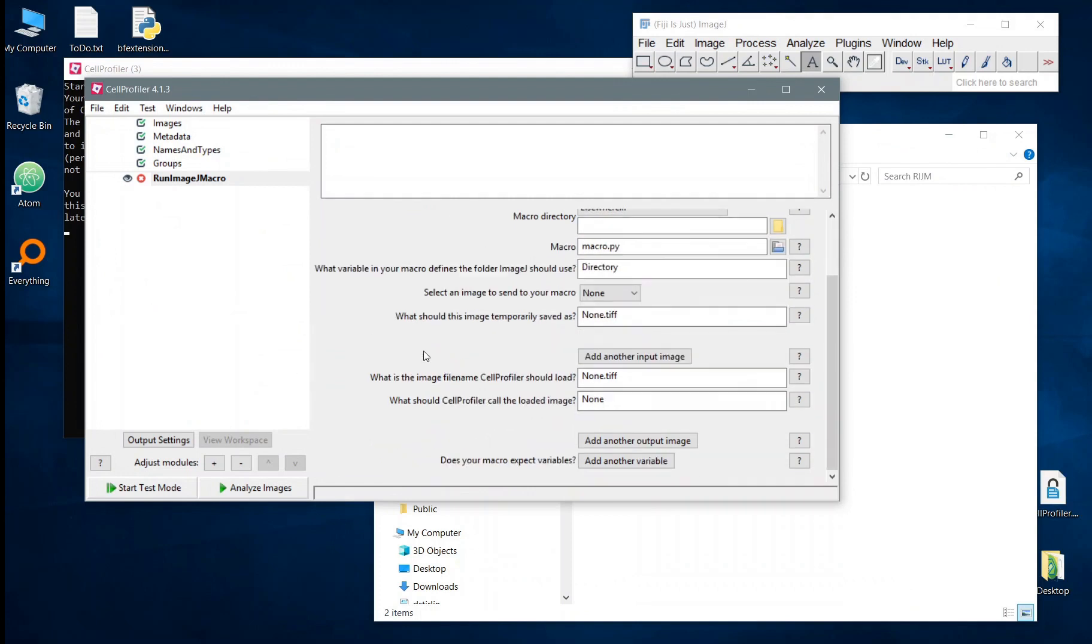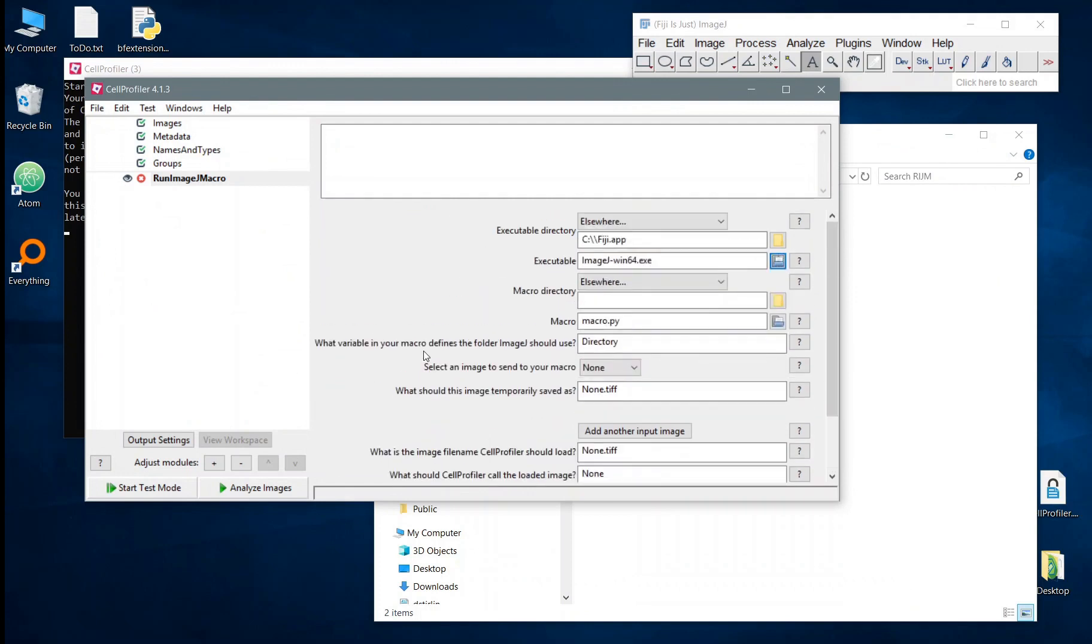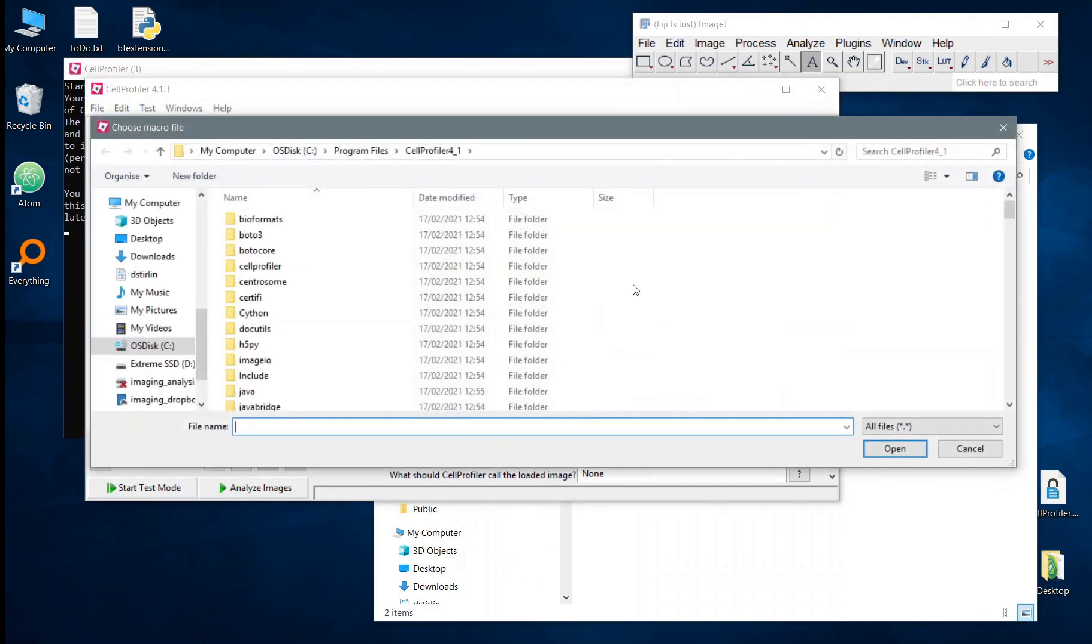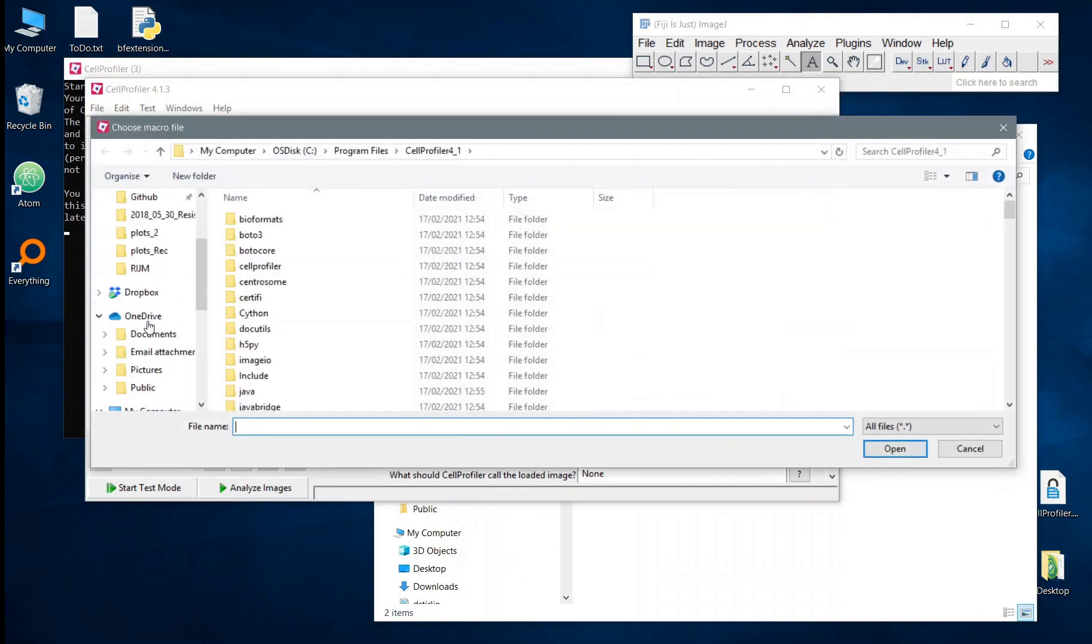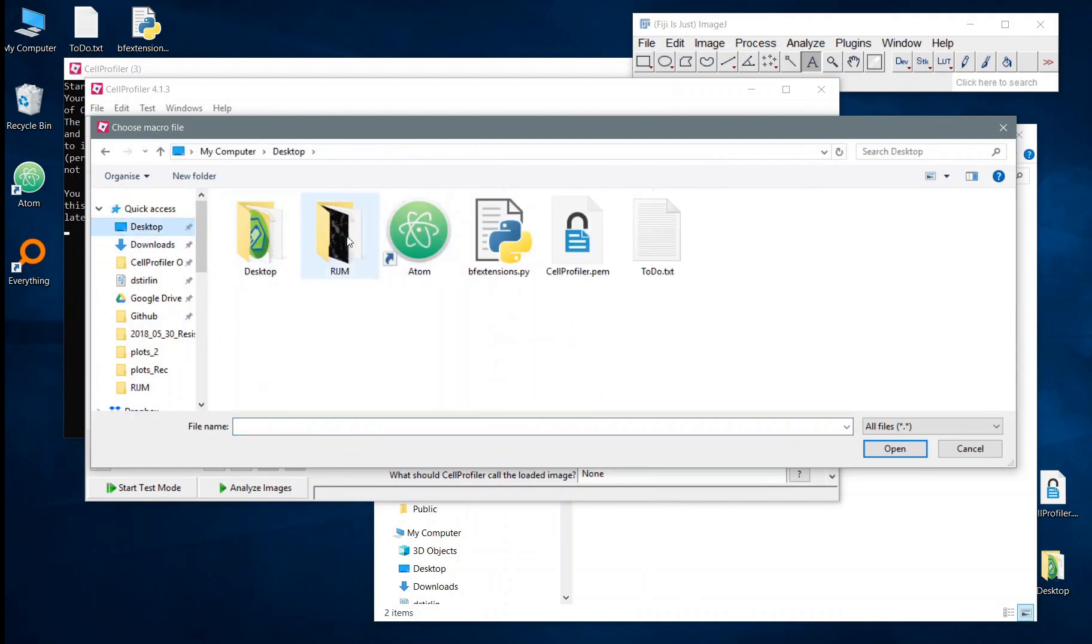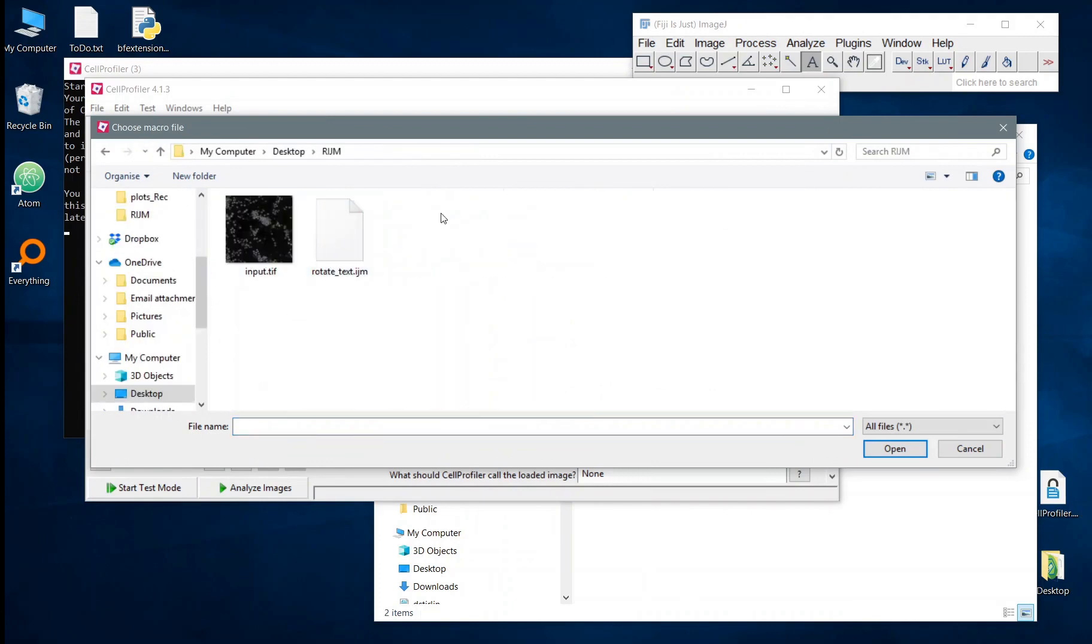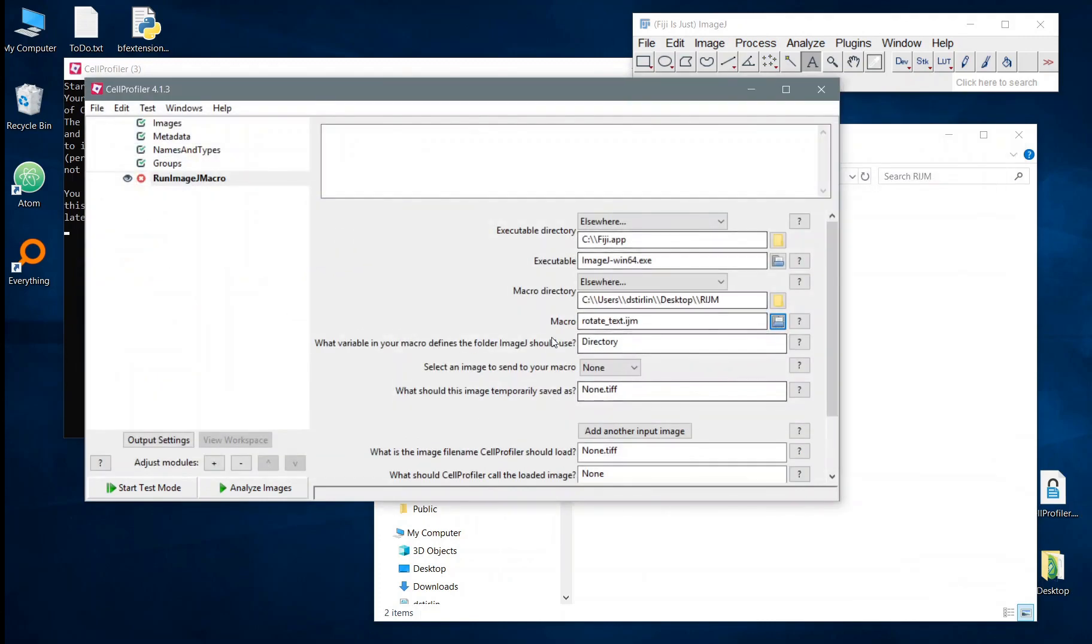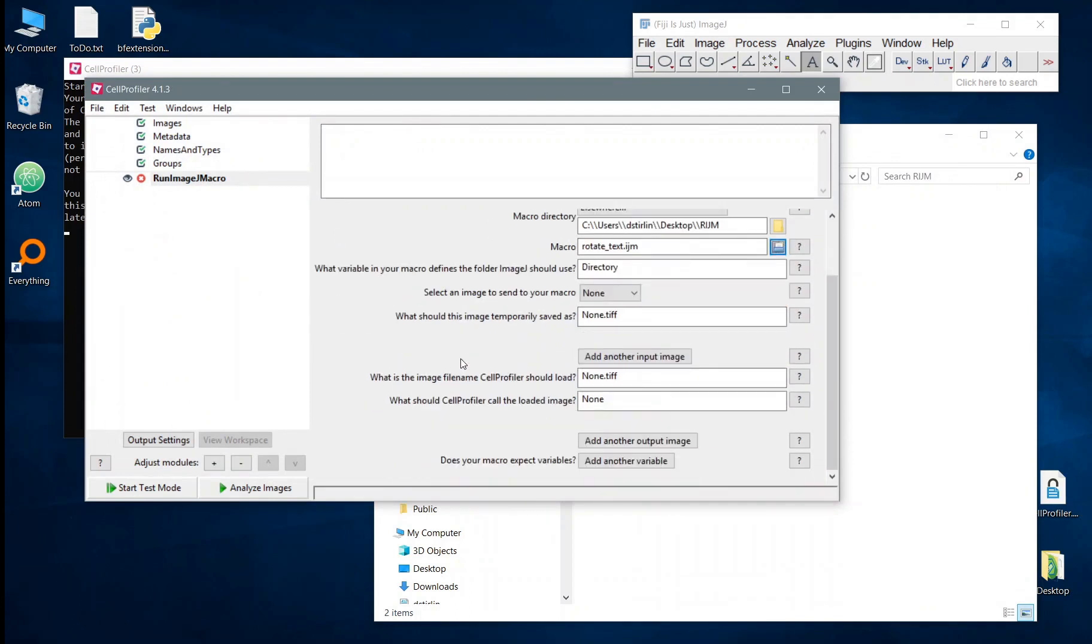You'll see we've got some other settings here. One of the important ones will be the macro itself. In this case I've already written a macro which we can use in this particular demonstration. So let's go into this folder I made just to test things and open up the rotateText macro. The following settings are all about what's going to be passed into the macro and what's going to come back out.